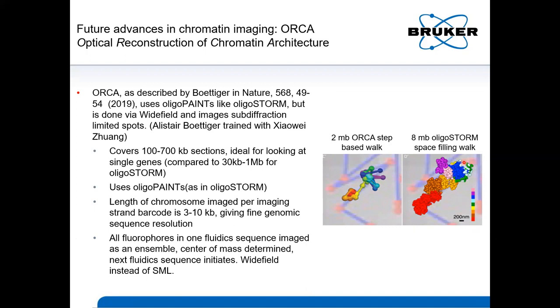Our most recent project has been working to integrate a workflow into SRX known as Optical Reconstruction of Chromatin Architecture, also known as ORCA. ORCA uses Oligopaint like OligoSTORM does, but rather than image at the single molecule level, it takes subdiffraction images at the wide field. All the fluorophores in a single genomic region are imaged as an ensemble rather than stochastically.